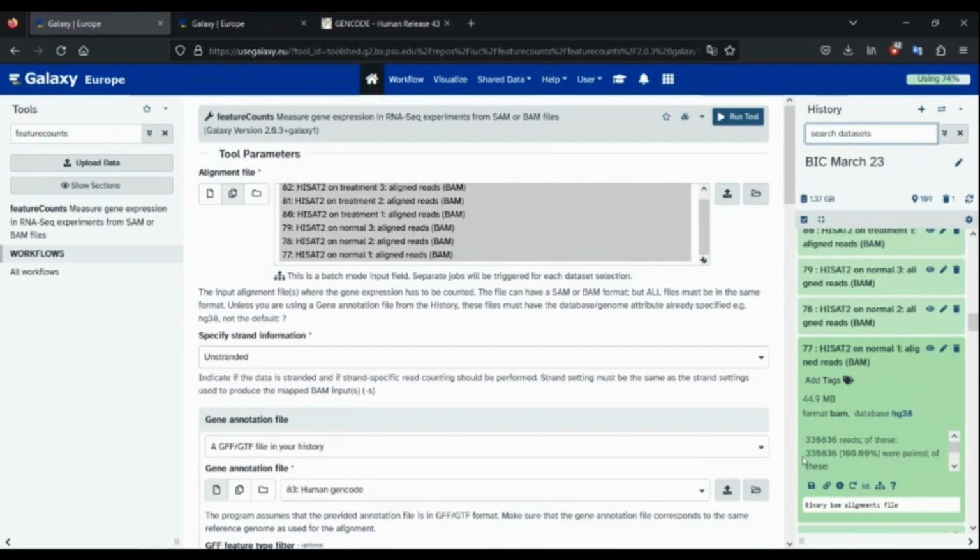So how much percentage of your sequence has been aligned to your reference genome. Now, the first statistic says that we have this many reads, and out of that, this many reads, 100% were paired. And we already know that these were paired-end reads. The second one says this many aligned concordantly 0 times. That means 7.44% did not align to the reference genome. 87.76% aligned exactly once. And around this much, that's 4.8%, aligned more than one time.